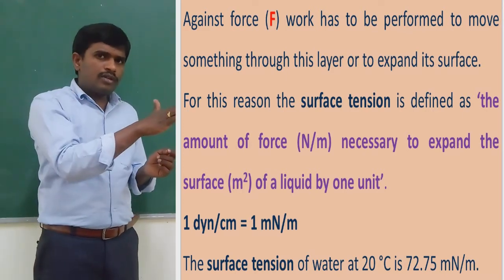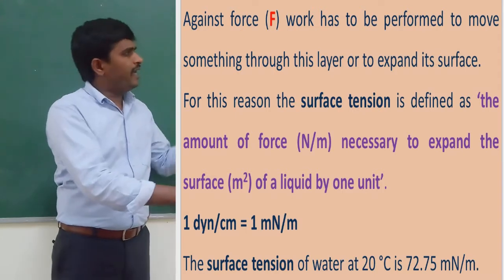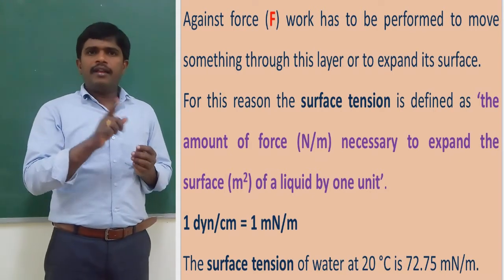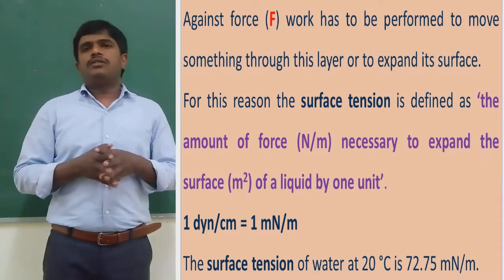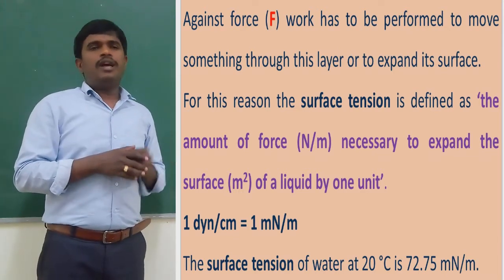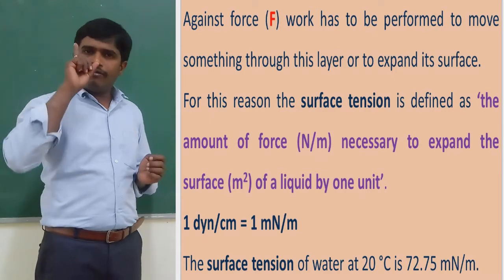Against the force, work has to be performed to move something through this layer or to expand the surface. For this reason, the surface tension is defined as the amount of force, in Newton per meter, necessary to expand the surface, in square meters, of a liquid by 1 unit.